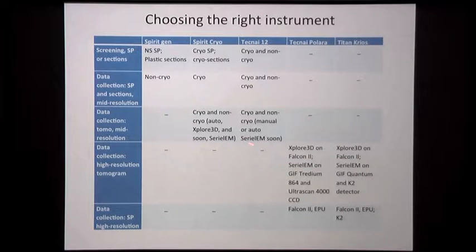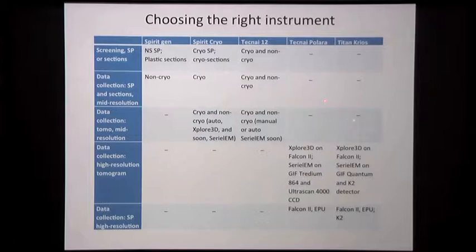And then we will soon have tomography ready, so people can use this one more before you move to the data collection machines, because they have very long queues. This one is perhaps 2 or 3 weeks, but this one at least 4 weeks. About 2 weeks ago I counted 29 active internal users. It's not that a group leader puts a name down; they really come to use it. That means if everything is okay, you get 1 session a month, but if the microscope breaks down or has some software problem, your time there is really limited. So these are our three machines.